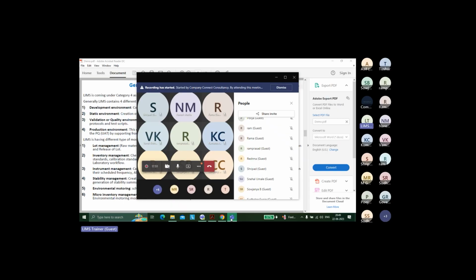Then I went a bit further and explained how the table structure is built inside LIMS, inside LabWare. I need to take one particular tool and explain, so that you get some idea about how the tables are built in LIMS, and you can relate later that if I am using this LIMS, it has to be this way. Because in all LIMS there has to be one sample table, inside that one test table, inside that one result table. So some generally used tables, how to write queries, and how to understand those table structures, I always teach them.